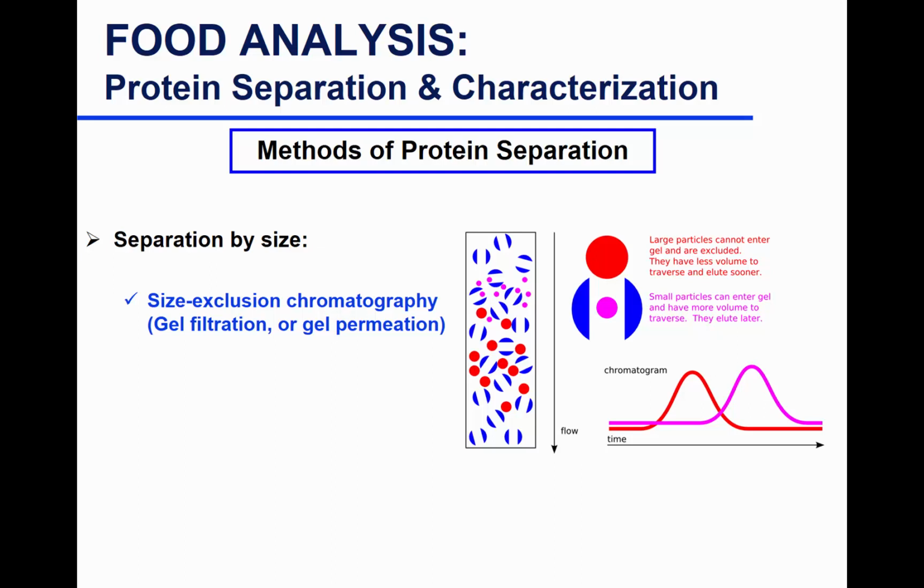Chromatography, separation by size. So we do that a lot in the lab on a research scale, and it's also done on industrial scale. So you can separate proteins based on their size. If you generate hydrolysate and you care about bioactive peptides to put them in pharmaceutical types of application, then you want to separate those small ones from the large proteins, then you can do size exclusion chromatography to do that. And please review chromatography for the final. It will be in everything.